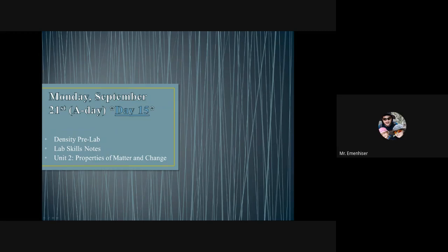So today is day 15. We are starting Unit 2, which is on properties of matter and change. So we're actually getting into some chemistry. We're going to talk about some lab skills, about accuracy and precision, percent error, things like that. We're doing the density pre-lab, which means that our lab is going to be on density, and we're going to be doing that lab later this week.